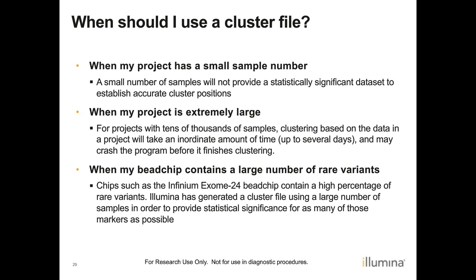Chips such as the Infinium exome 24 have a high percentage of rare variants. We have generated a cluster file for that chip using a large number of samples in order to provide statistically significant data and positions.